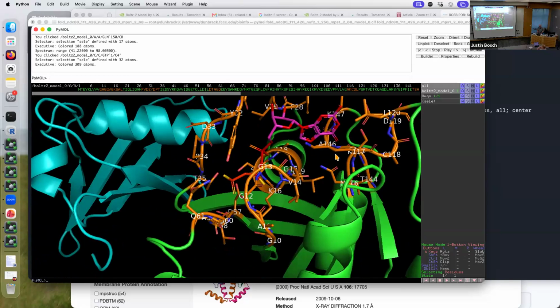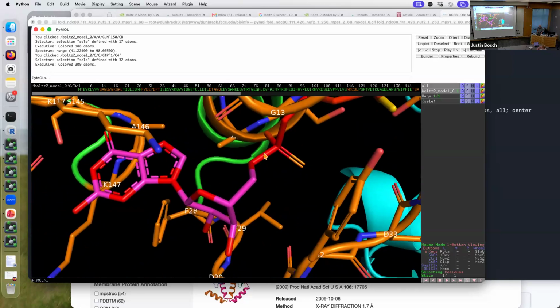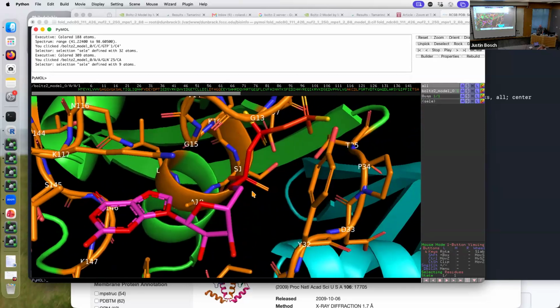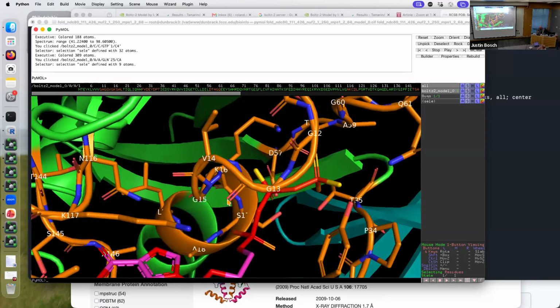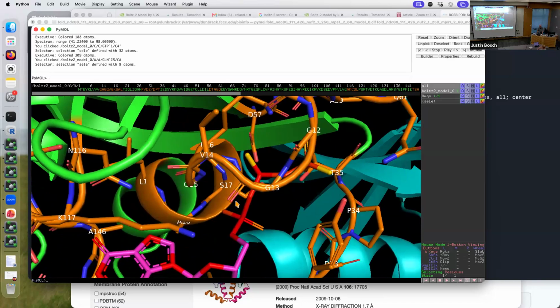This is very helpful because we can zoom in on that GTP and look at all the amino acids that are really nearby. And are there any favorable interactions, maybe between the phosphate and residues in the protein? And of course, it's going to be harder to find them when I have to do this live. Well, there's at least one.